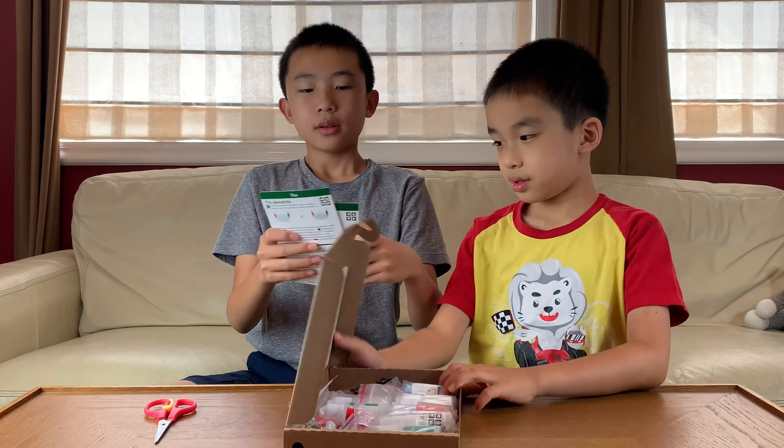First we'll be doing the tin dendrite, which is difficulty 1 out of 3, danger 2 out of 3, and duration 10 minutes. And the tin hedgehog is the second experiment.